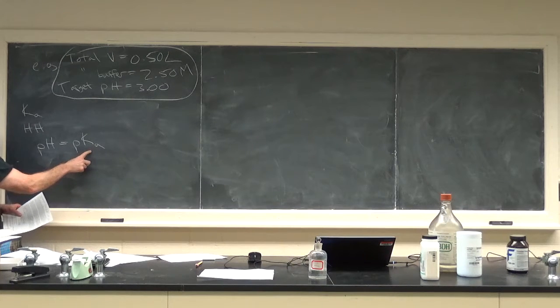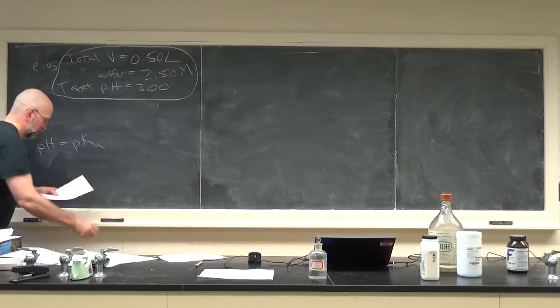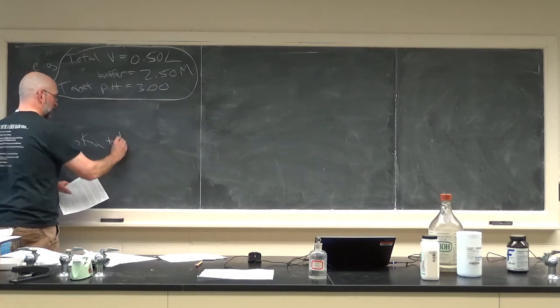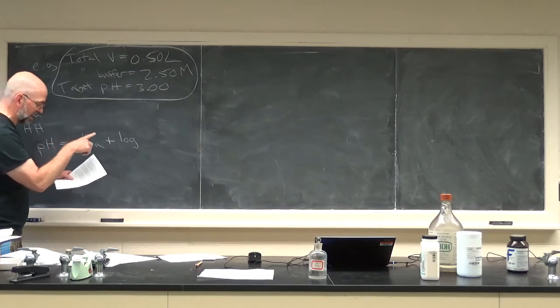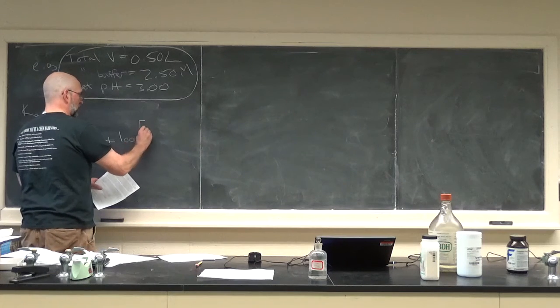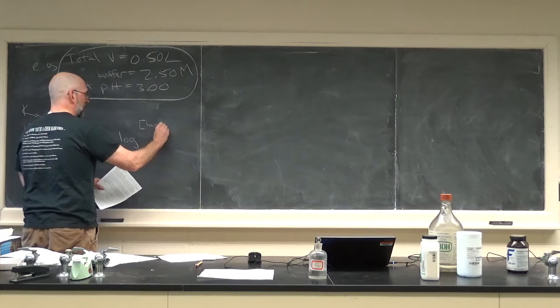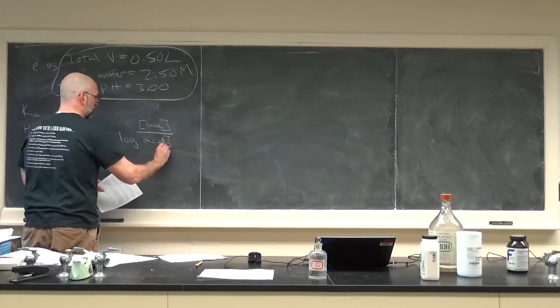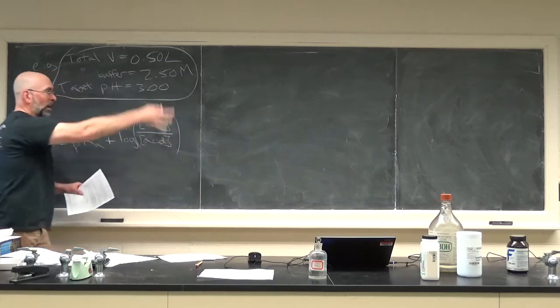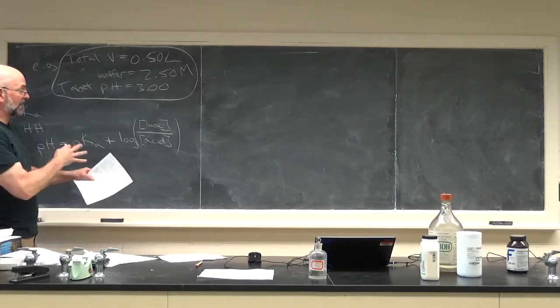So you've already determined this. Plus the log base 10, not natural logarithm, of your base concentration over your acid concentration for whatever system you've identified as the appropriate one.